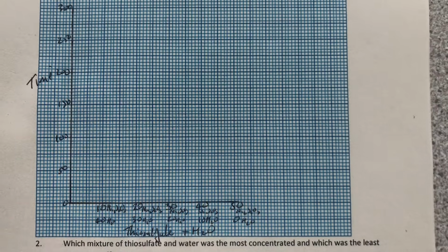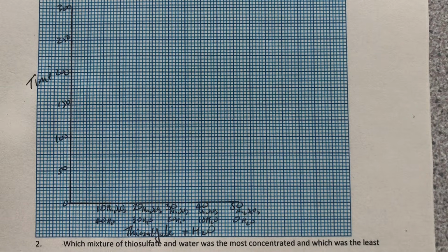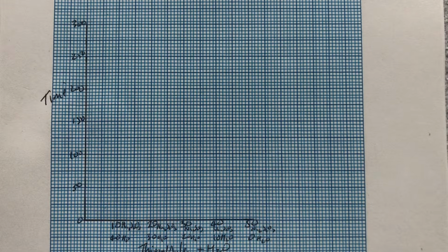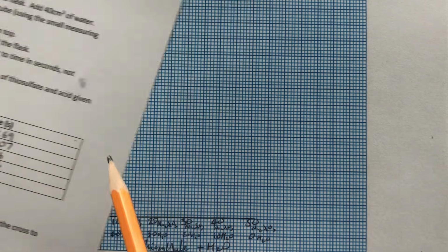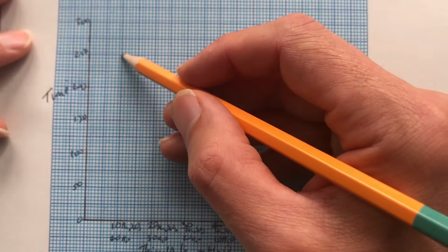Now I've already labelled up some axes for you. I've got the thiosulfate and the water down here. I've got the time up on that axis there. Now it's important we plot our graphs with pencil, and we take our time and we find out exactly where these crosses go. Okay, so the first one was 269 seconds for the 10, so there's our 10 there, and here's our 250.